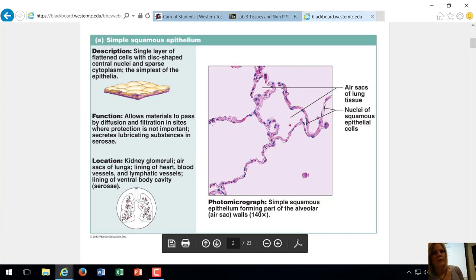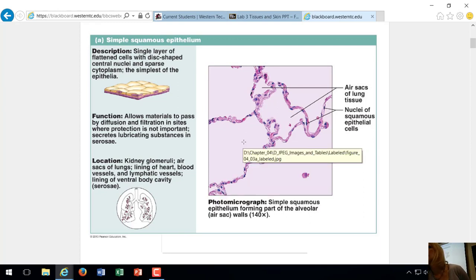So what I see here, this is not a cell. These are layers of cells end to end. It's layers forming a wall of the alveoli in the lung, those small air sacs. These are all made up of simple squamous cells, layers of cells. You can see the nuclei in each one.